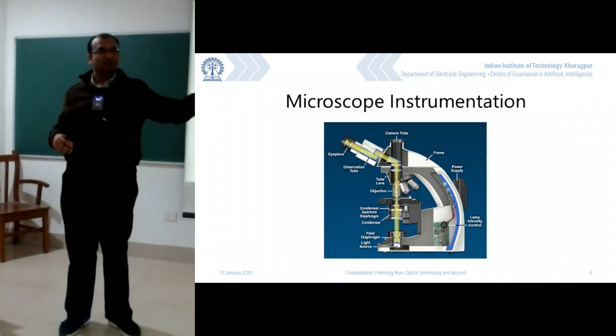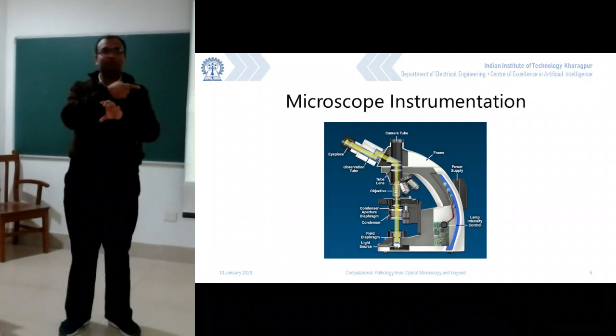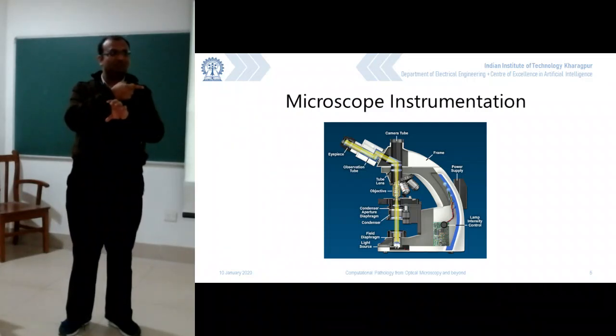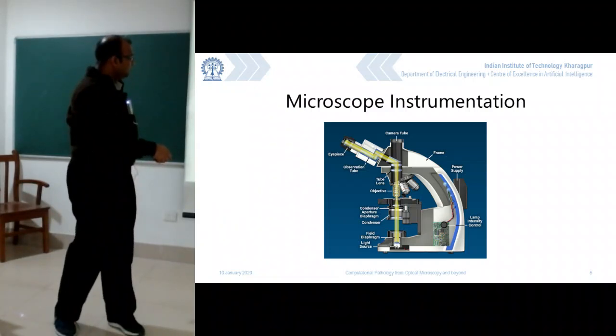So basically, if there are parallel rays which are incident on a lens, then everything will converge on the point source over there, which is the point of focus. If I place a source at focus, then it will again use the same rectilinear propagation of light concept and make a parallel beam. So this bulb is situated over there. You have a lens which essentially makes a parallel beam, and that comes over here.